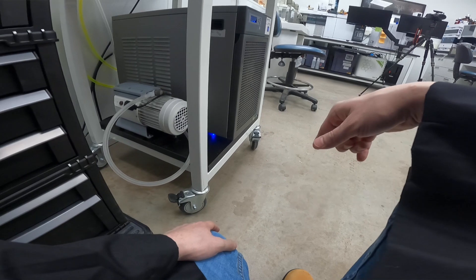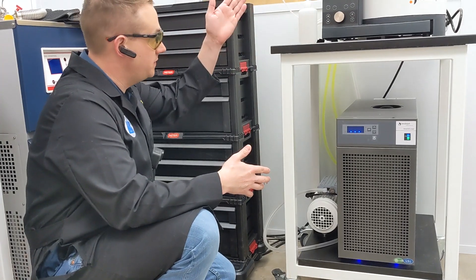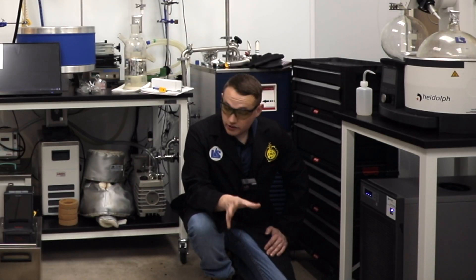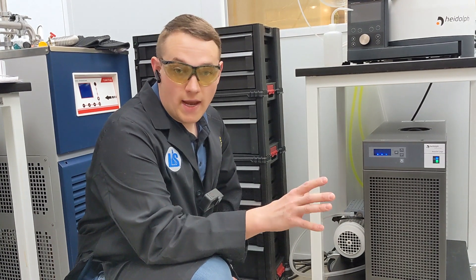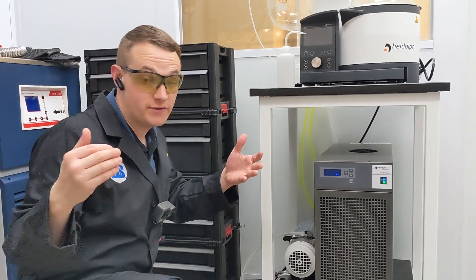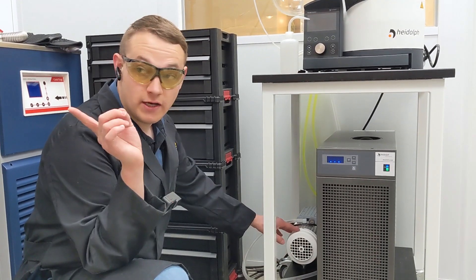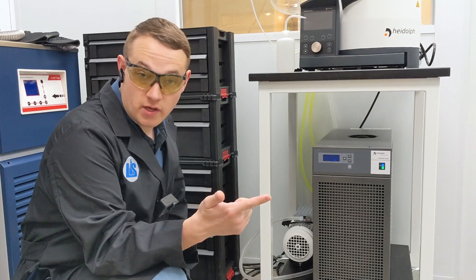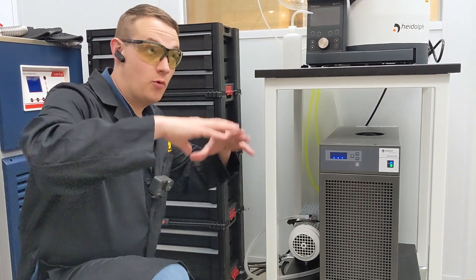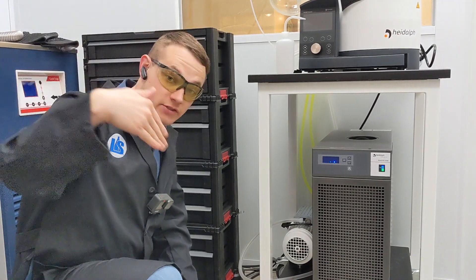Both of the pumps we've just spoken about are dry pumps. In the lab, we want to make sure that we use dry vacuum pumps for anything that's going to be a wet application — specifically solvent recovery, filtration, things that will have molecules and vapors of potential solvents going through. We also want to make sure that the diaphragm pumps are compatible with whatever solvents we're using. These pumps are compatible with non-polar solvents as well as polar solvents — alcohols, pentane, anything like that. The key is using them in a well-ventilated space, preferably plumbed up to a hood to evacuate any vapors out of the lab.